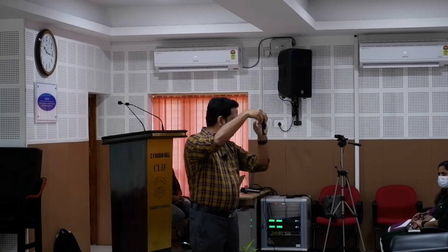Okay, so now we have this tip coming closer and closer according to the equation e raised to minus a constant into z. Let's say e raised to minus k d, where d is the distance. As I go smaller and smaller in d, exponentially larger numbers of electrons I will get. This equation will come later. This alpha, forget about this term; only this term is sufficient for now. So this is e raised to minus a constant into the distance between the tip and the sample. That is basically the tunneling current we are going to get.